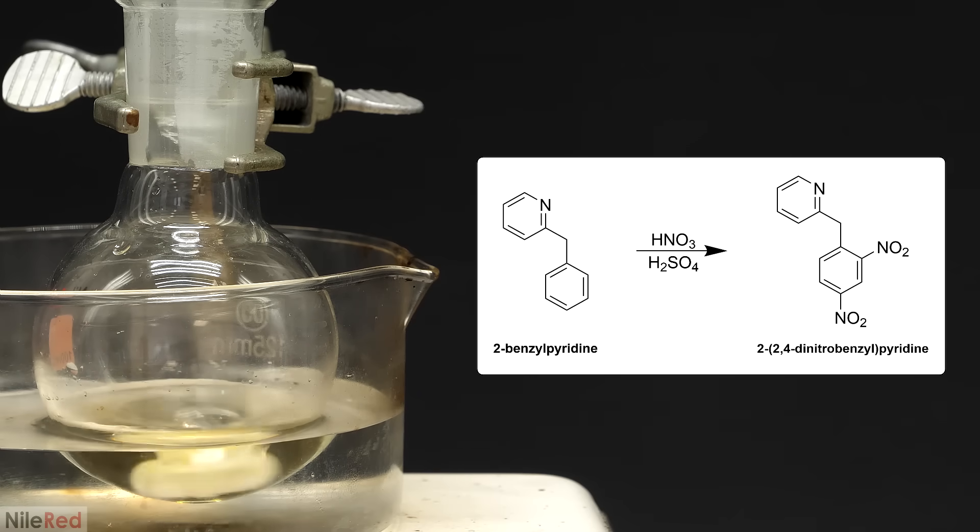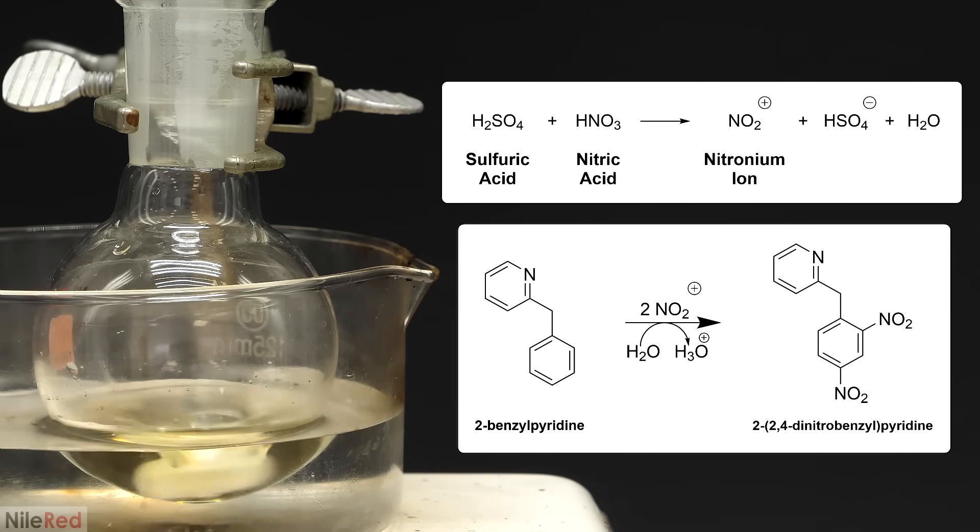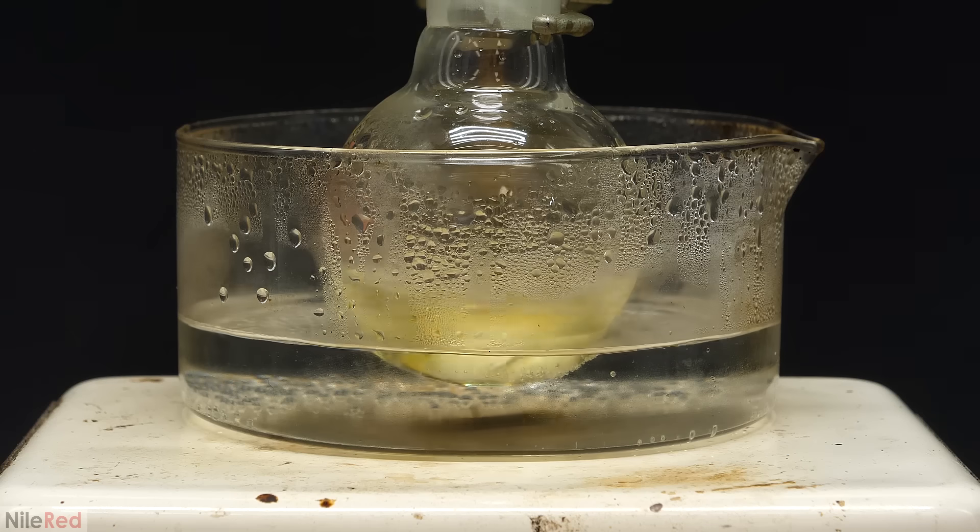What was going on here was a nitration reaction, where 2 nitro groups were being added to the 2-benzalpyridine to make DNBP. In a bit more detail, the first step was a reaction between the sulfuric and nitric acid to make nitronium ions. These were the active nitrating species, and they were attacked by the 2-benzalpyridine. Under these conditions, DNBP was the major product, but I'm sure that to a certain extent other nitrated forms were also made. These just had to be purified out in the workup, and you'll see how I did that.